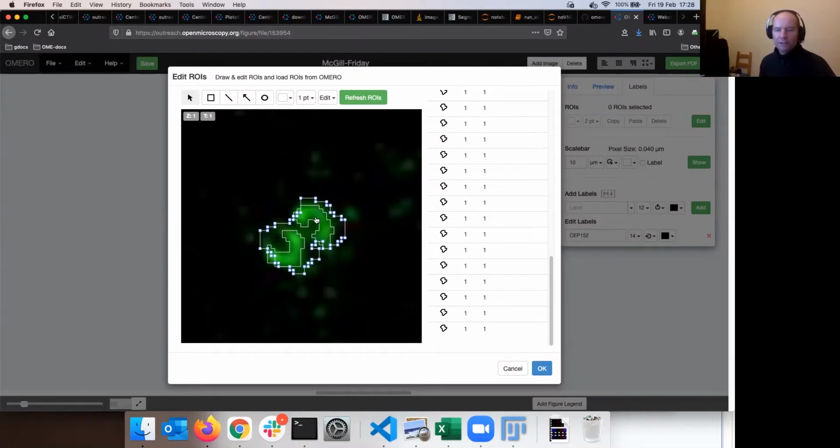We were going through with you the workflow in Fiji where we were doing the segmentation, thresholding, and analyze particles, and the regions similar to this one were coming up, and then we were saving them back to OMERO. And this is one of those regions. We were running the scripts as we were showing to you from the scripting editor of Fiji or via the Jupyter notebooks on 414 images, and on each of those images, that's why I didn't have to worry on which image there is a ROI and on which not, because on all of them there is ROI, okay? You saw it in OMERO.parade, by the way, also.